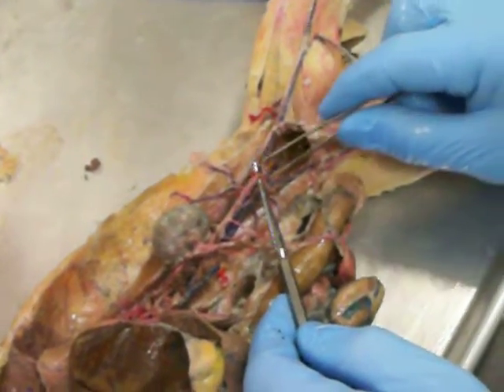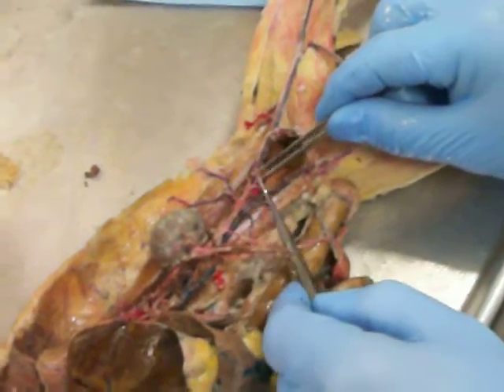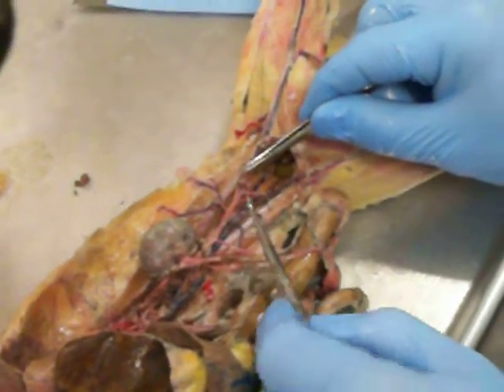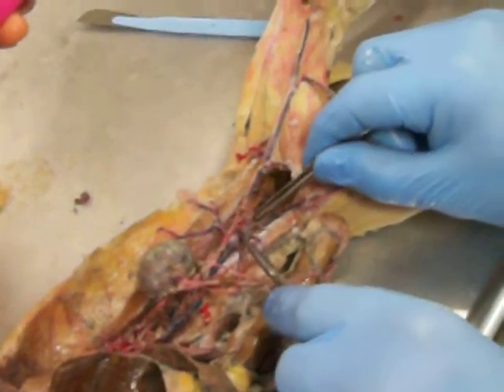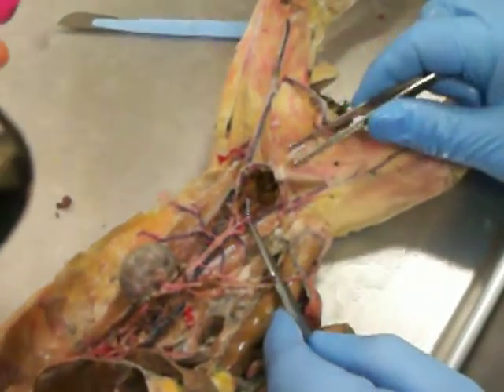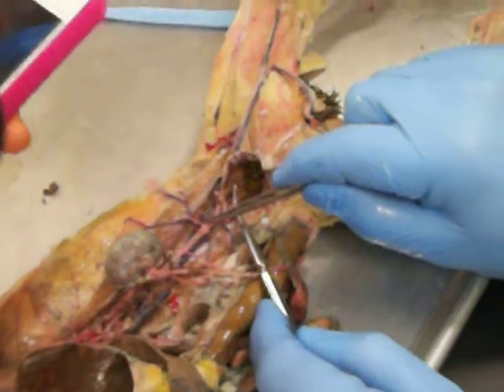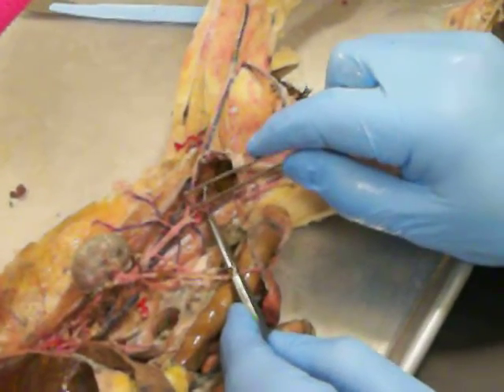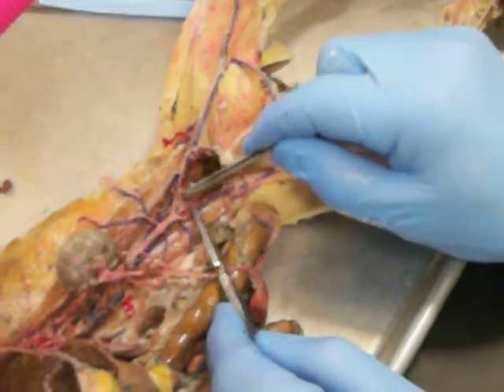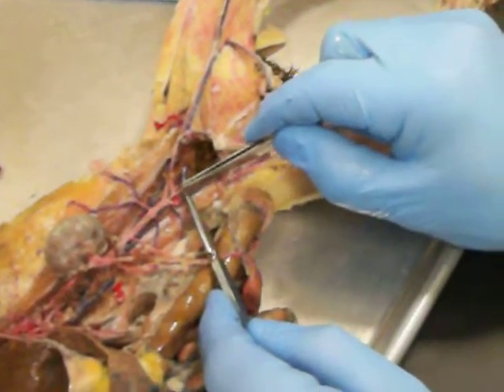And then we have another branch. The second smaller branch, these are the internal iliac arteries. And then you can see that we have one artery that continues down, and this is our caudal artery. So, descending abdominal aorta, left external iliac artery, left internal iliac artery, and then caudal artery, right there.